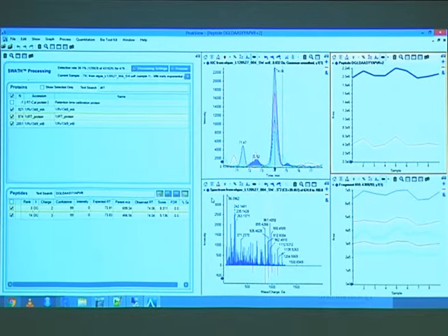What you see here are the fragment ion areas, intensities listed. This one here is for the peptide. Now I filtered for one peptide sequence, which has 2 assays, so that's why you see 2 lines. If I don't specify the peptide sequence, it shows all the peptides that have at least one significant identification, and that gets much more crowded.